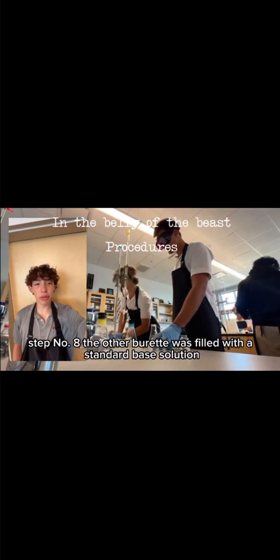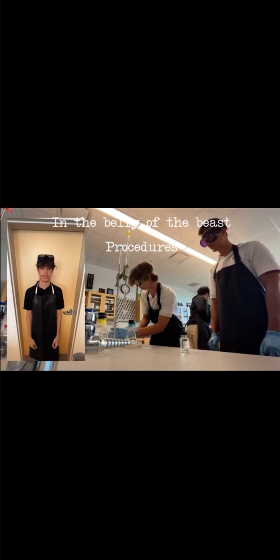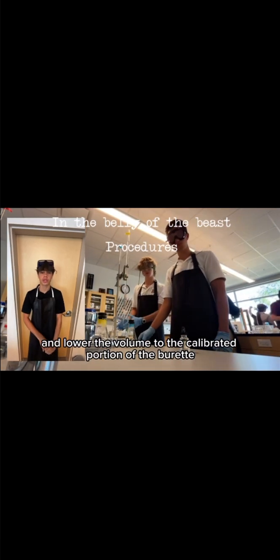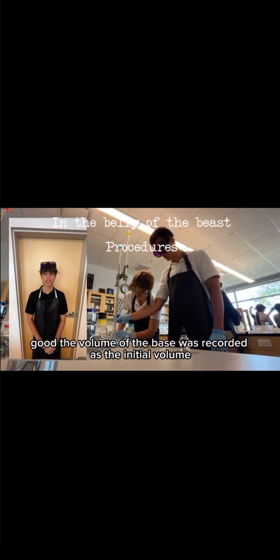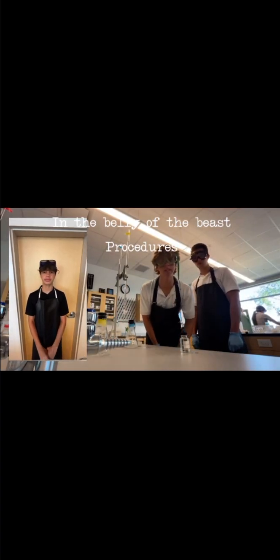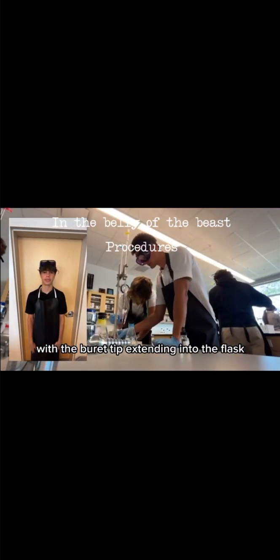Step number 8. The other burette was filled with a standard base solution to a point above the calibration mark. Some base was released from the burette to remove any air bubbles and lower the volume to the calibrated portion of the burette. The volume of the base was recorded as the initial volume to the nearest 0.01 milliliter mark. The Erlenmeyer flask was placed under the base burette with the burette tip extending into the flask.